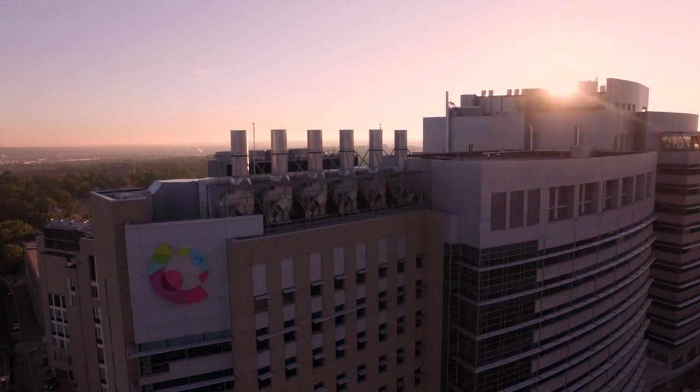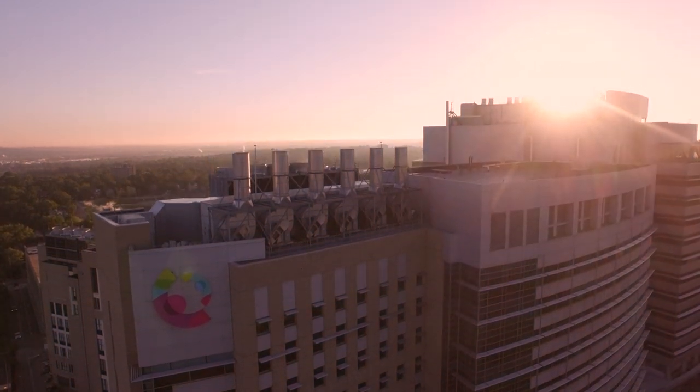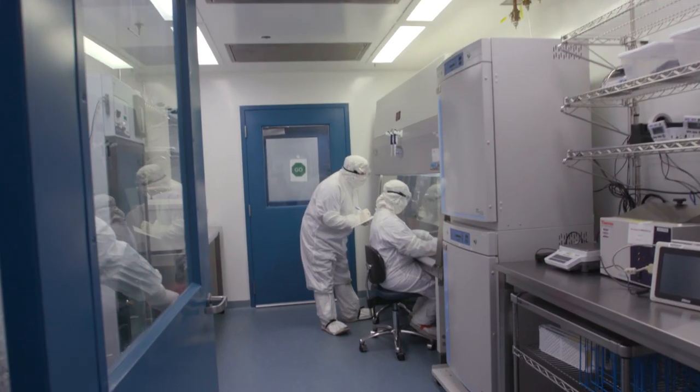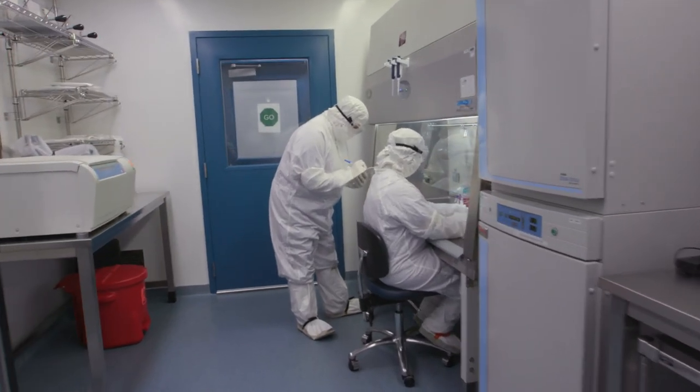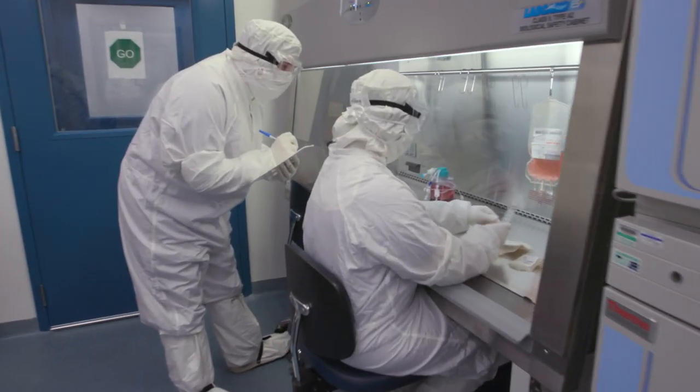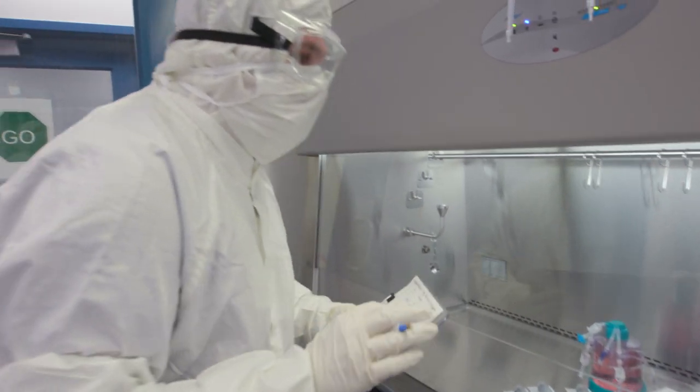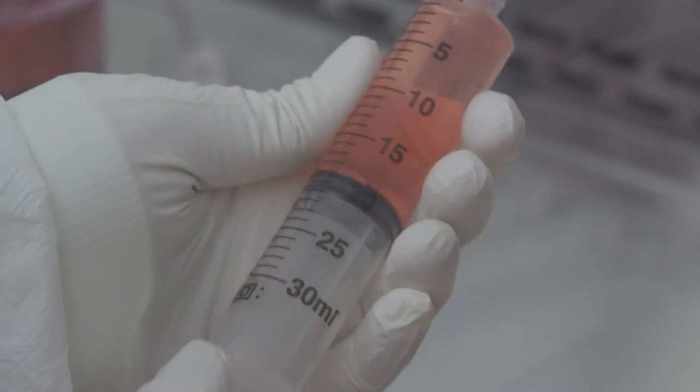Some laboratory work at Cincinnati Children's is sensitive to potential contamination. Sometimes it's so sensitive that the labs themselves are set up as clean rooms. The air inside clean room labs is more than 100 times cleaner than typical room air.